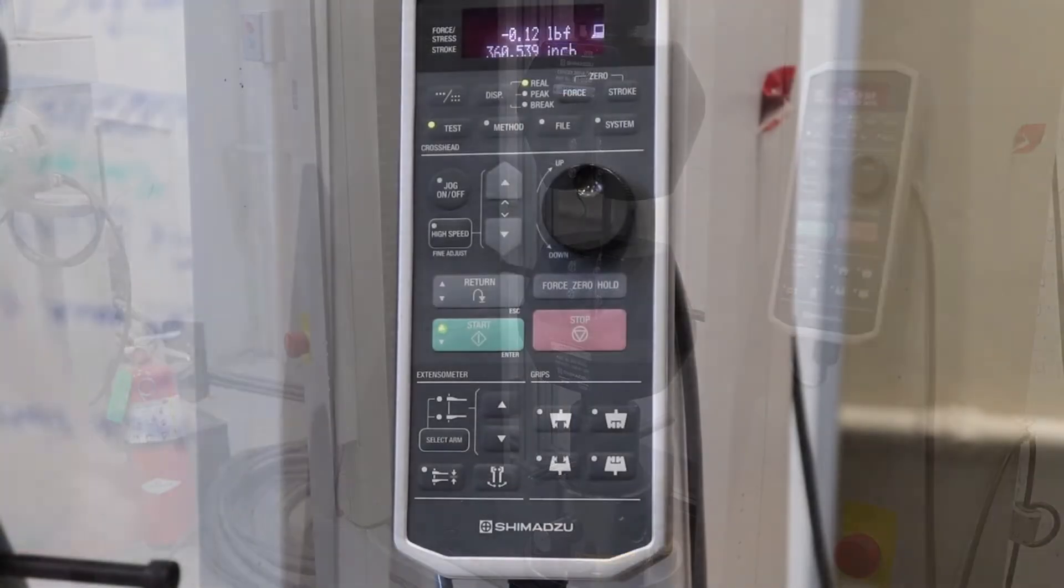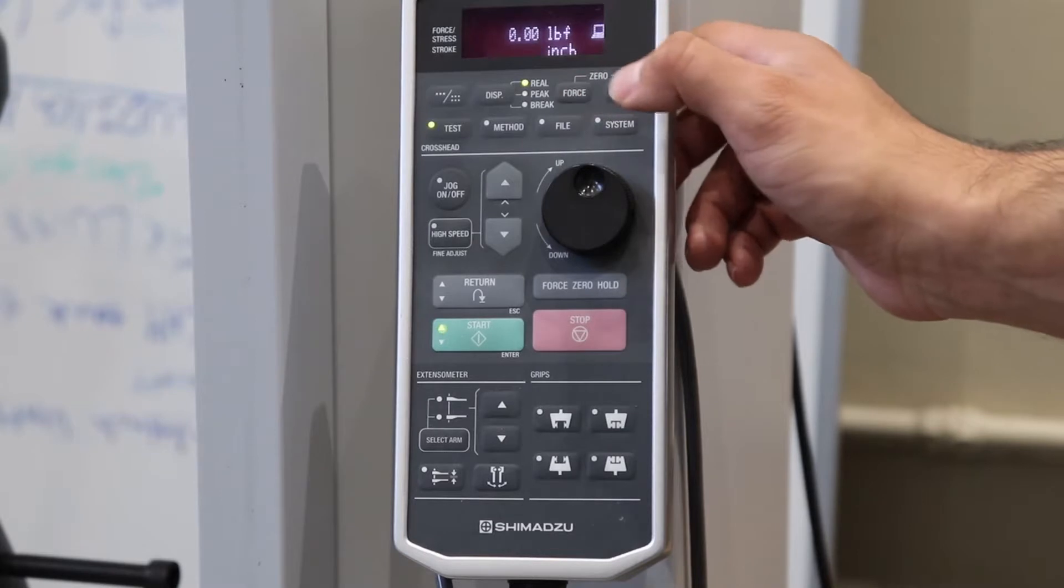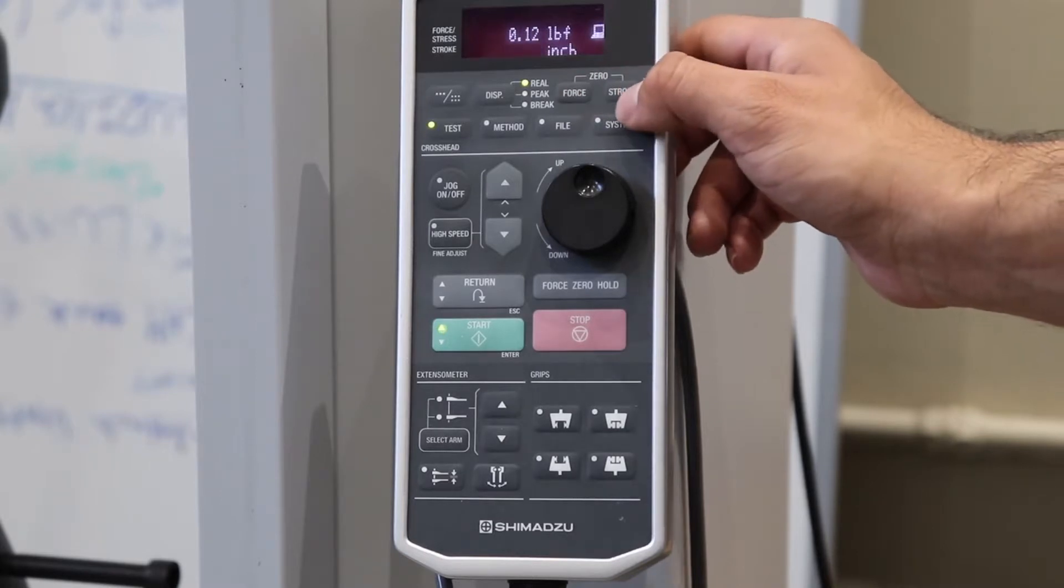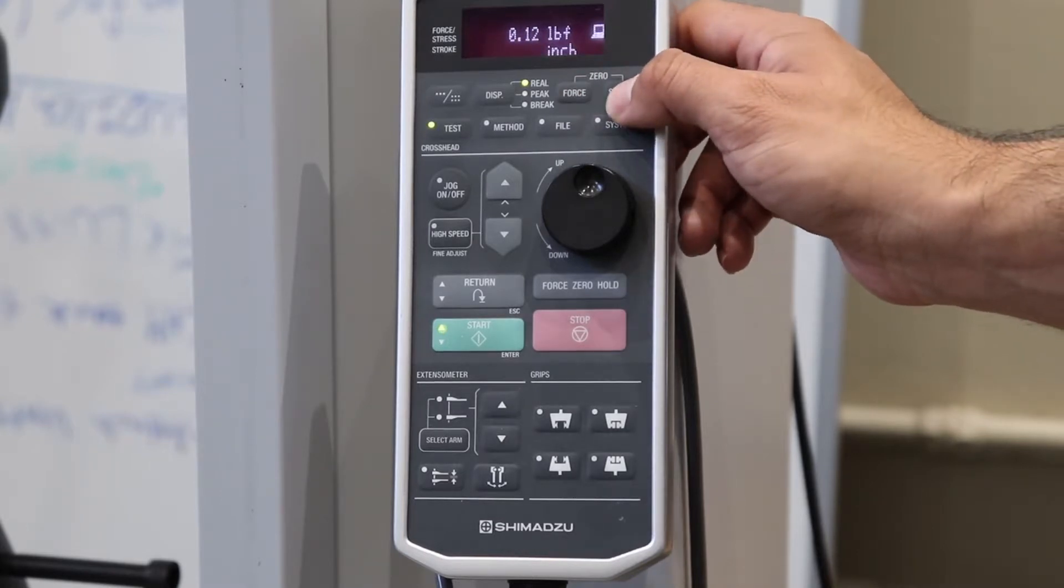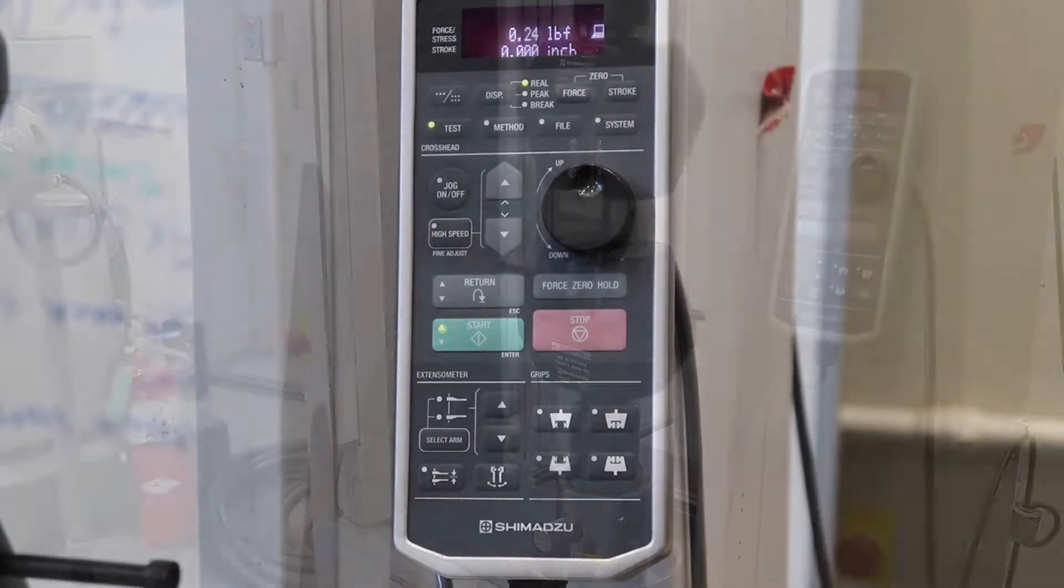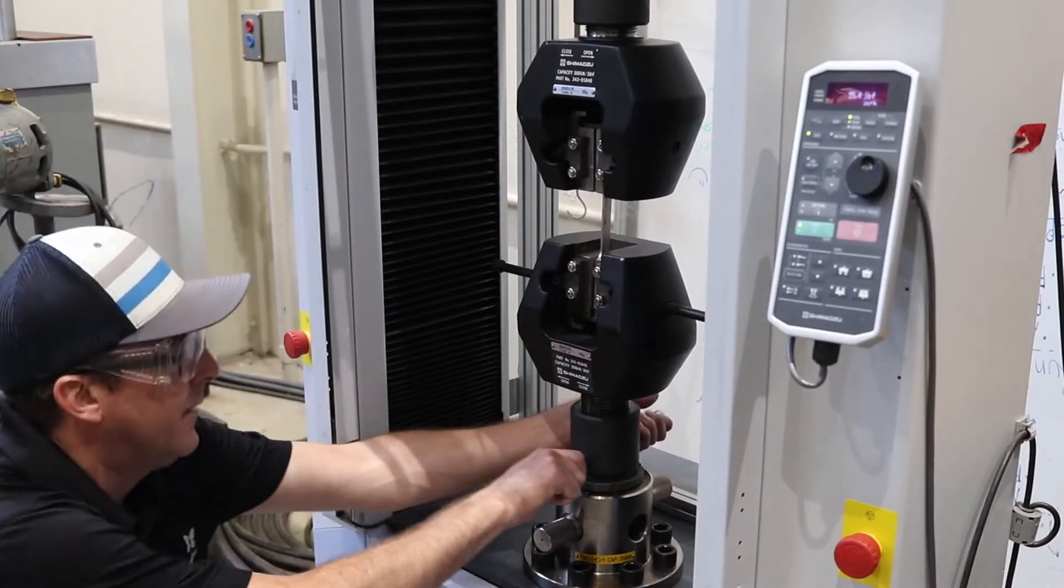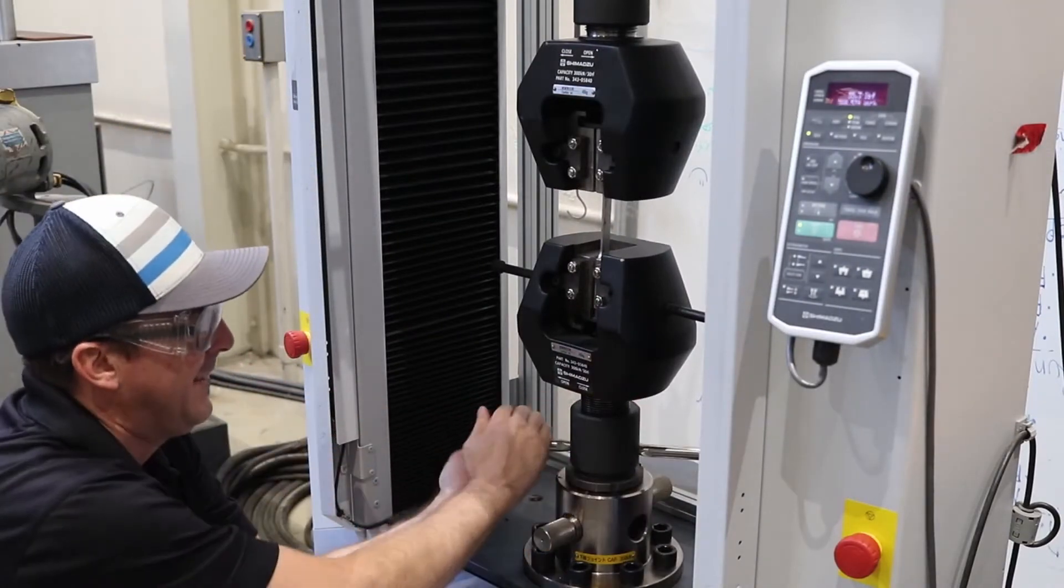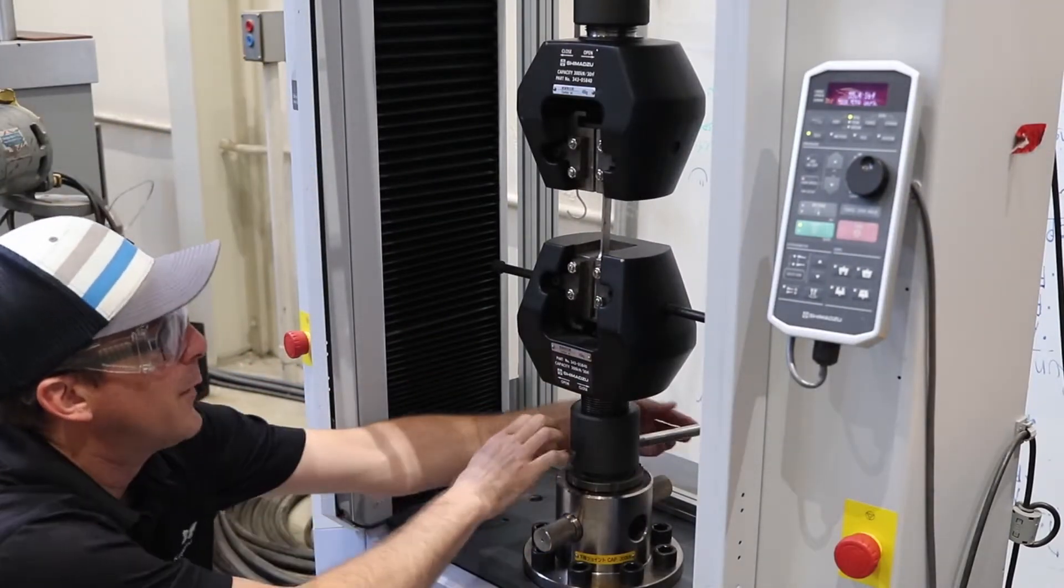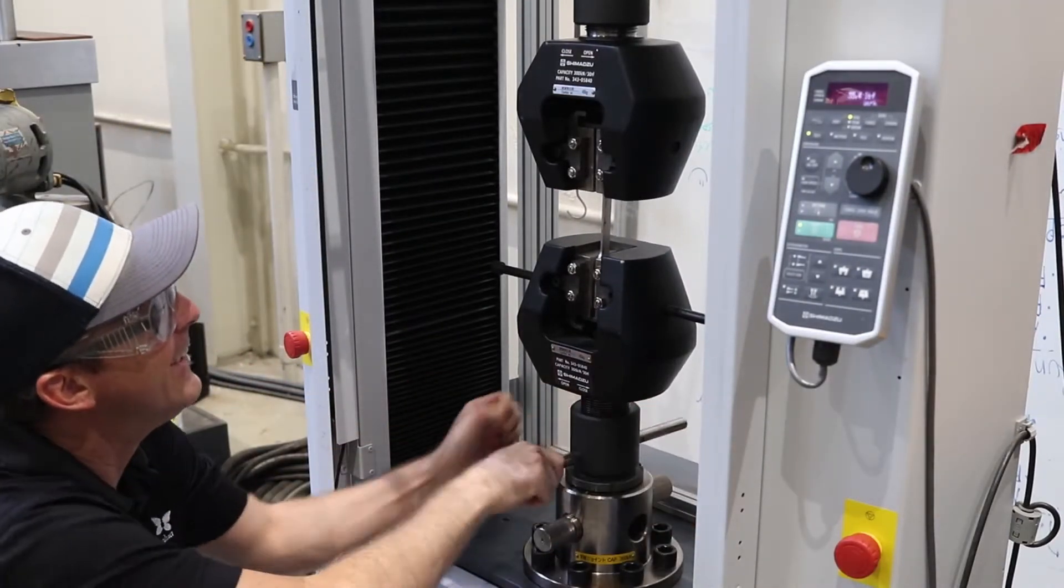We now zero the machine on the control panel, using the force zero and the stroke zero. This step is important to measure the preload. We now tighten the lower jaws, preloading the specimen.